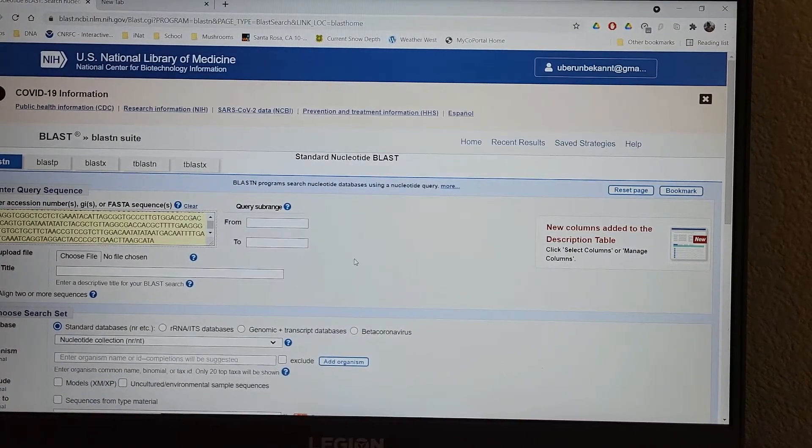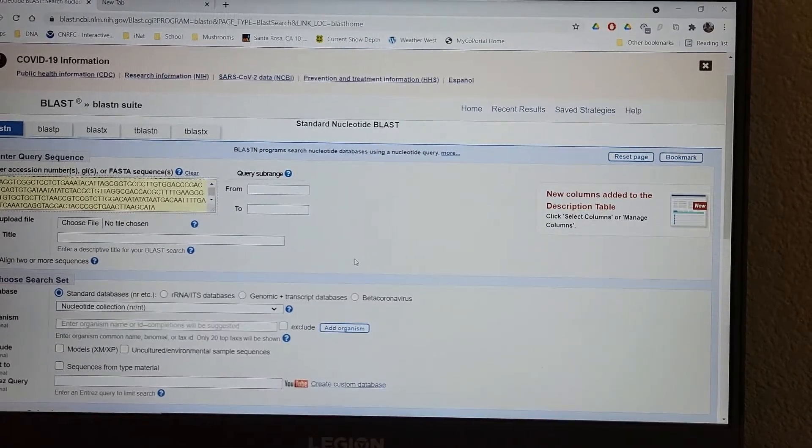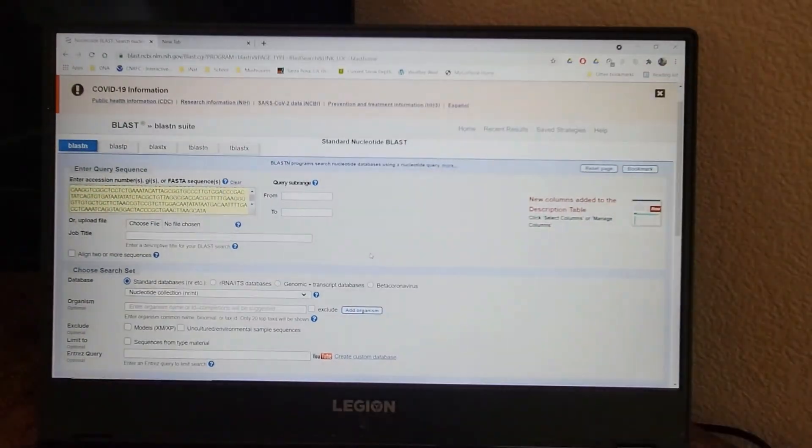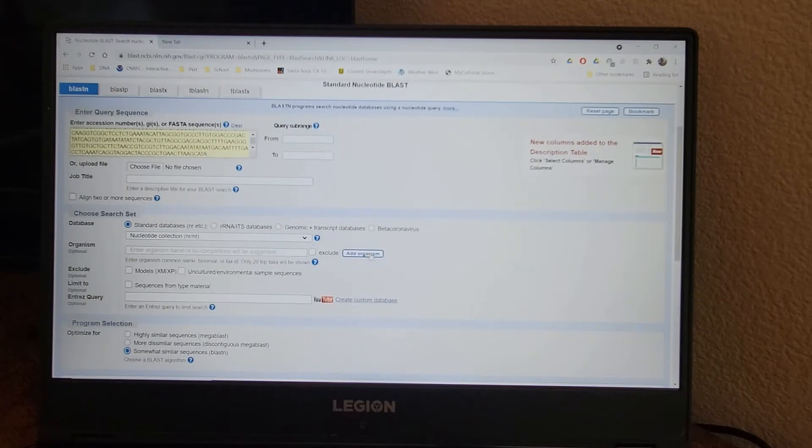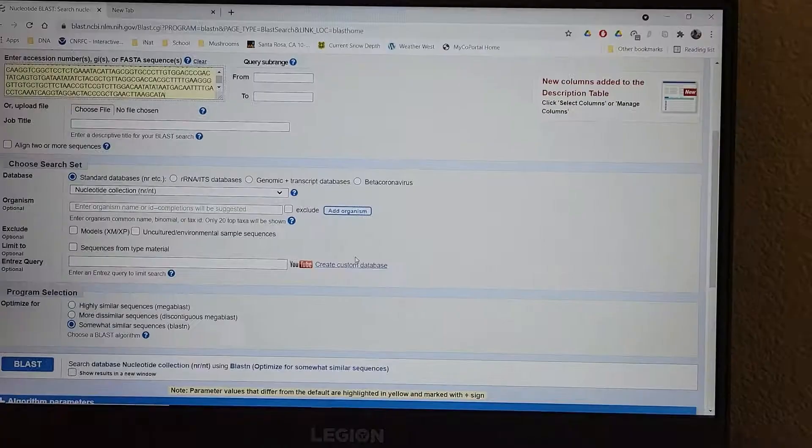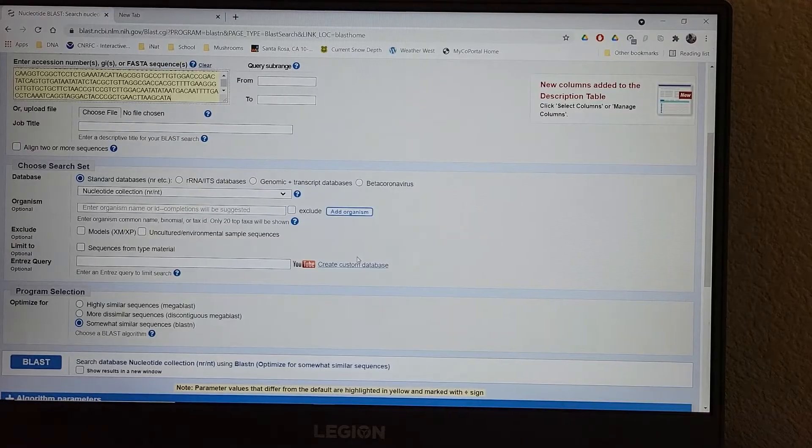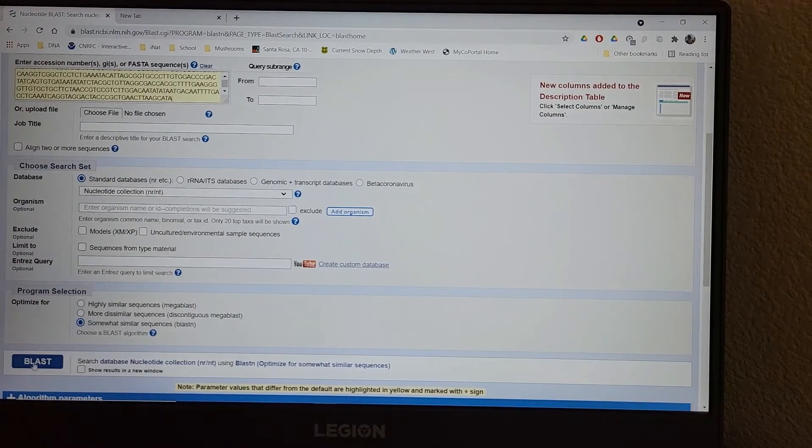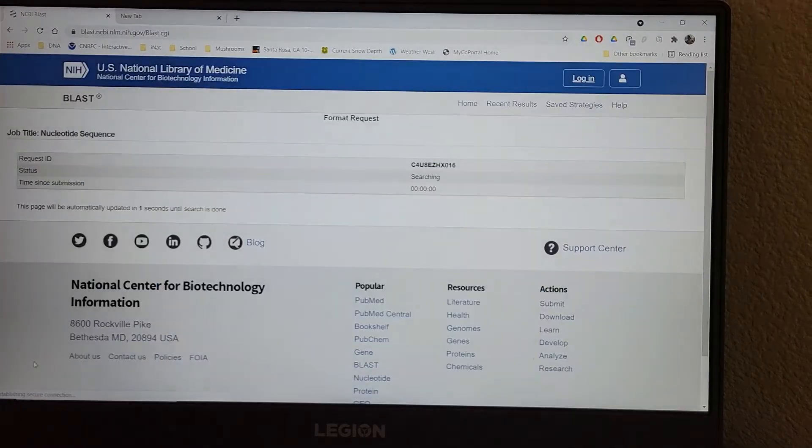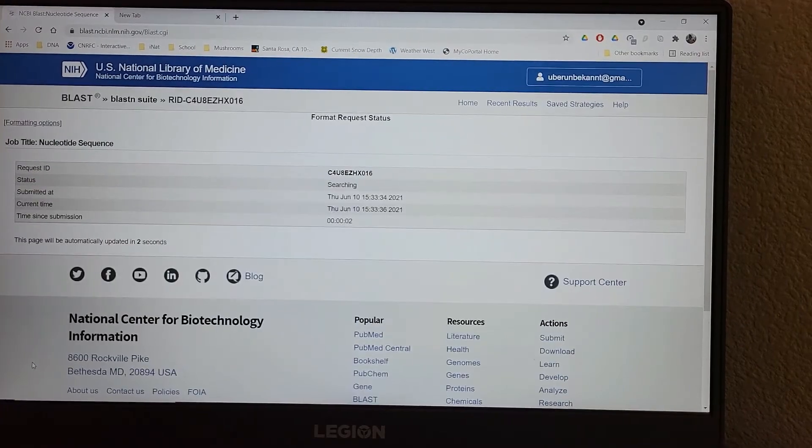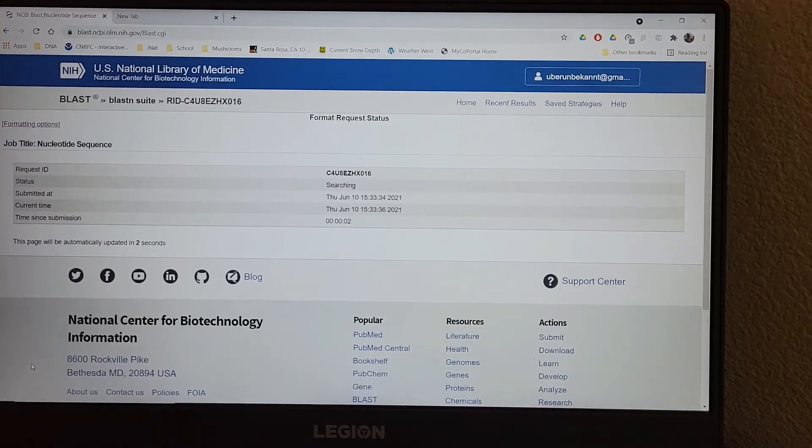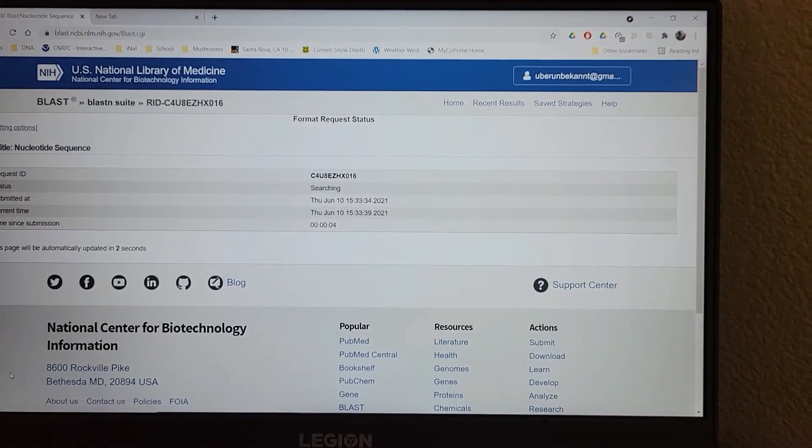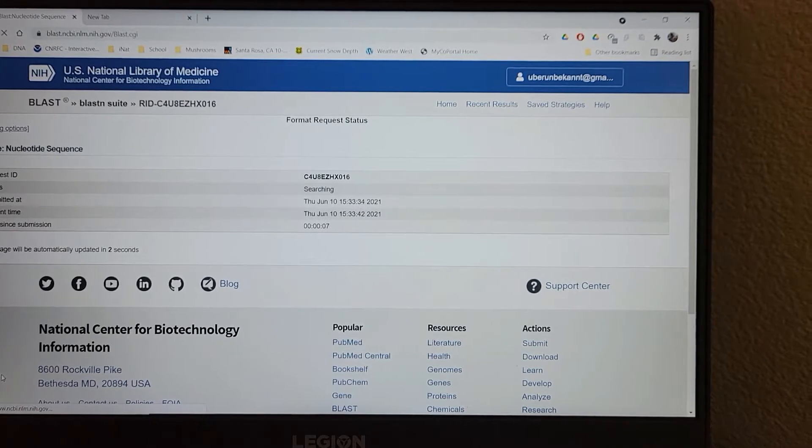I'm just going to paste it. Very simple. I'm not going to change any of the other settings here. And then I'm just going to hit BLAST. There we go.